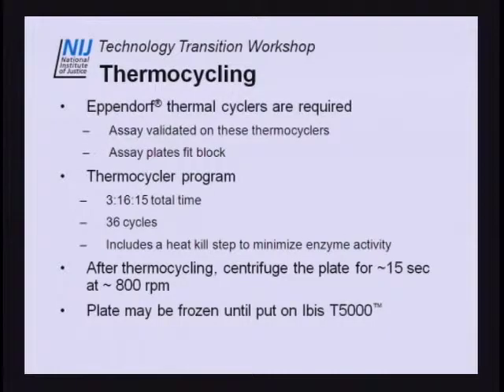The thermocycle program is in the neighborhood of 3 hours and 16 minutes. We do 36 cycles. We also have an additional 10-minute step at the end at 99 to heat kill the enzyme so that you don't get enzyme activity while it's sitting on the T5000 and getting that non-templated A. Because we've had cases where you load the instrument up for the night and unfortunately something happens, you do it wrong and you knock your hotel over, and your plates will sit for 24 hours before you come in and reset them. And you don't want that non-templated A occurring while they're on the deck.